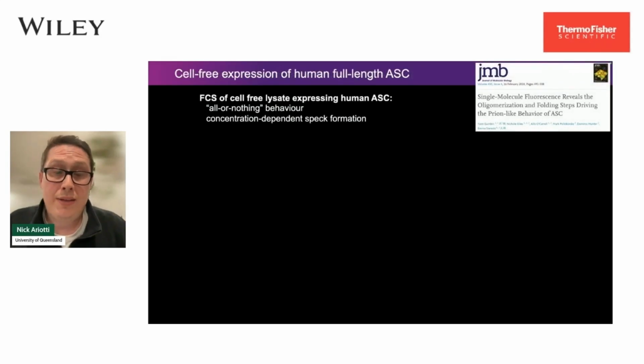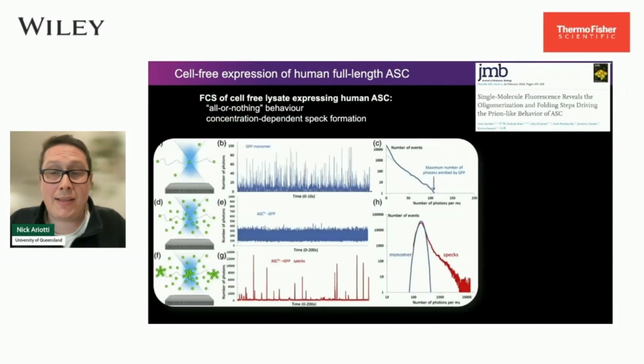From this work, our collaborators show that they can generate large molecular weight structures of ASC in cell-free lysates. They believe that these ASC specks, as they call them, resemble ASC formation in the cellular context.